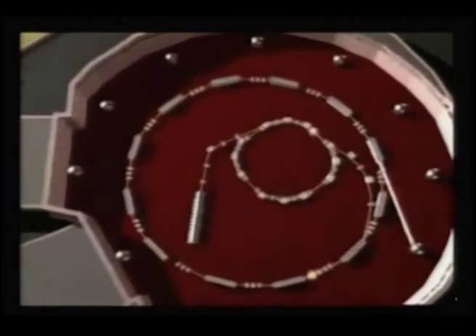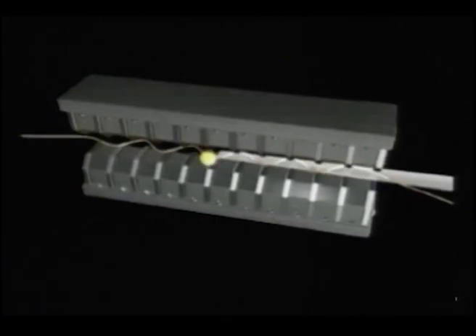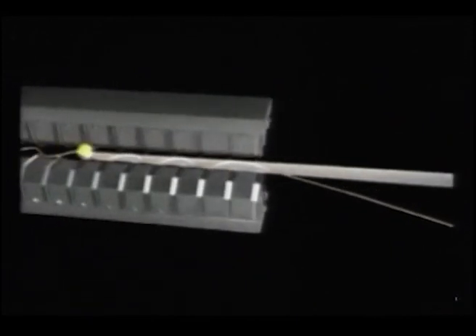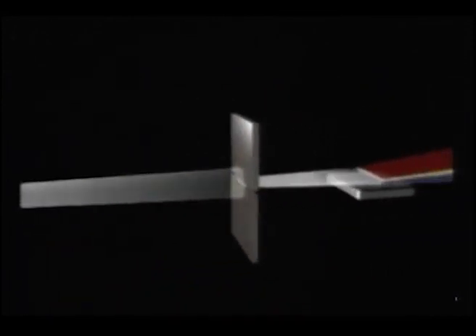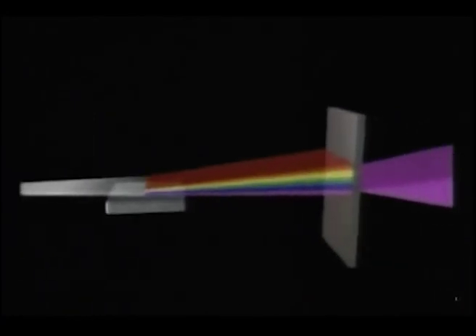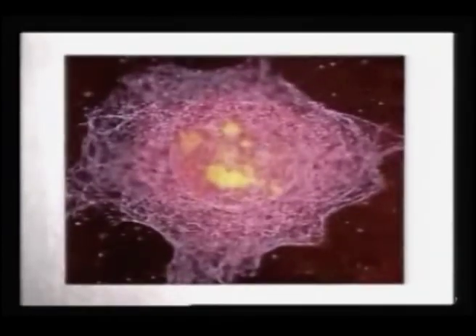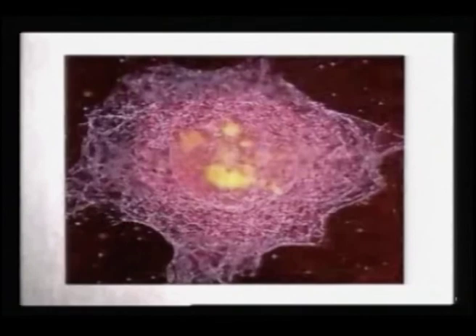Once it comes out to the periphery, it can go through several substations where these accelerated X-rays can be used, and this is how the booster works. And once it comes out, it can be monochromatized and interact with the material, giving much of the information that is needed, not just on spectroscopy. In fact, even imaging of structures can be done using this.